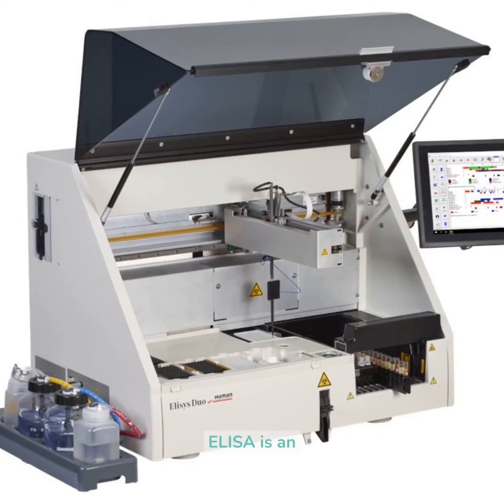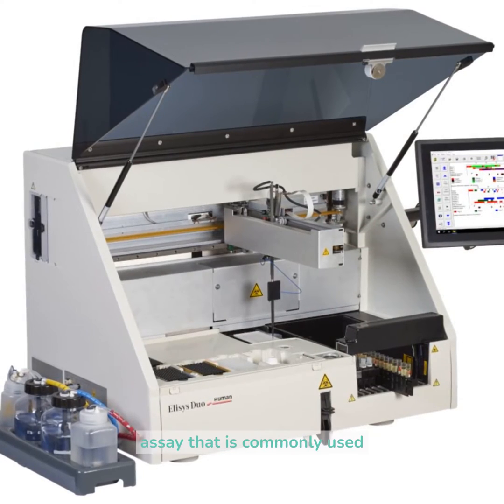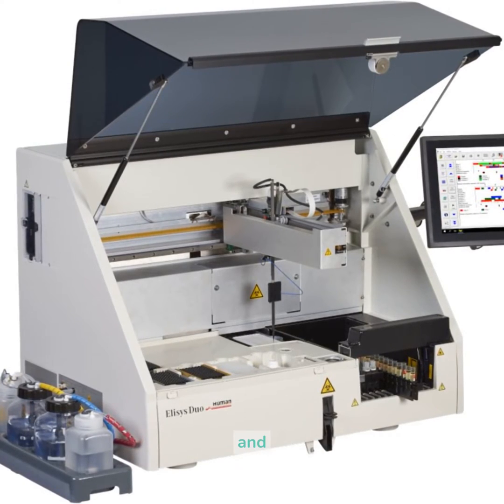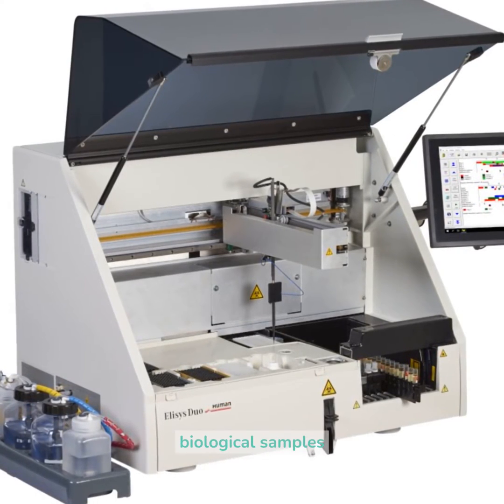How to work ELISA. ELISA is an immunological assay that is commonly used to measure antibodies, antigens, proteins, and glycoproteins in biological samples.